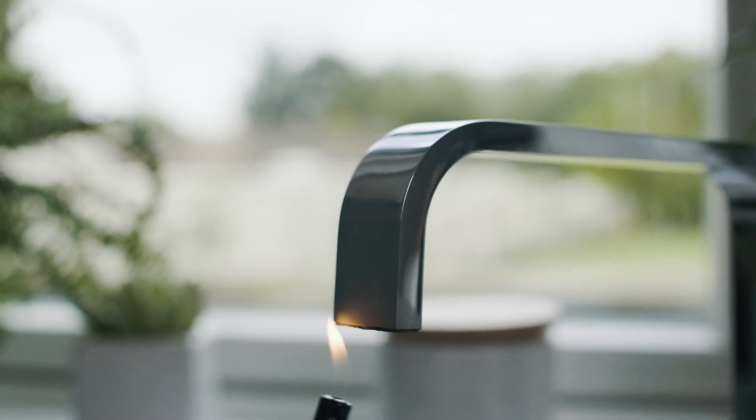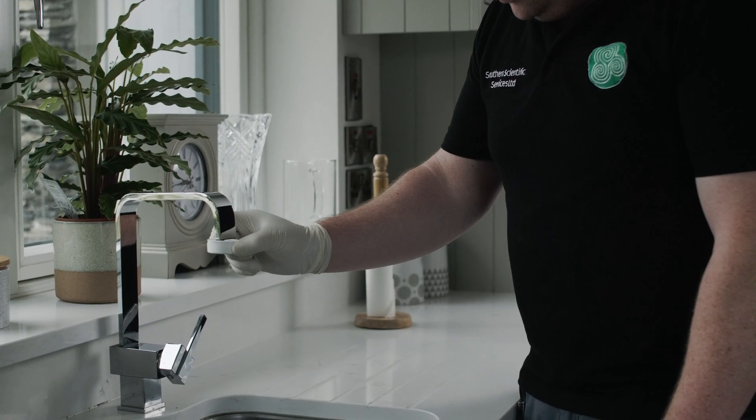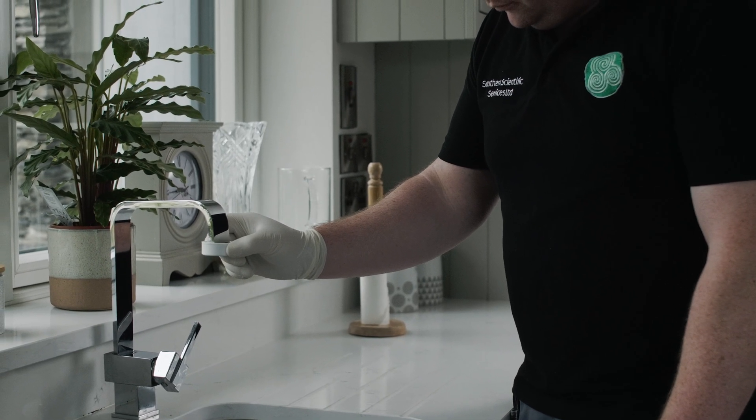Step 2. Turn off the tap and disinfect it by flaming or if it is fitted with a plastic anti-splash device disinfecting it using a 2% available chlorine solution such as Milton fluid.